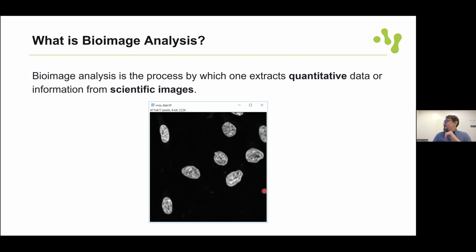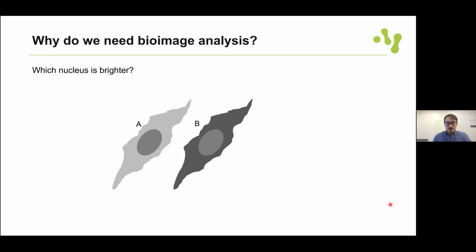So let's check the answers in the chat, because one thing I did not mention here is what we do with the nuclei that are on the edges. Some people might have counted them, but others didn't, because in this one you just see a very small part. Should you count it? Should you not? This would have been part of the bioimage analysis protocol. It should have been described and defined beforehand, before we even started analyzing the image.